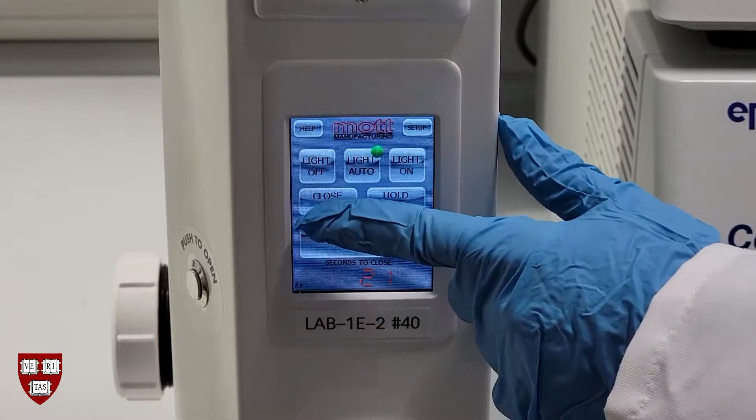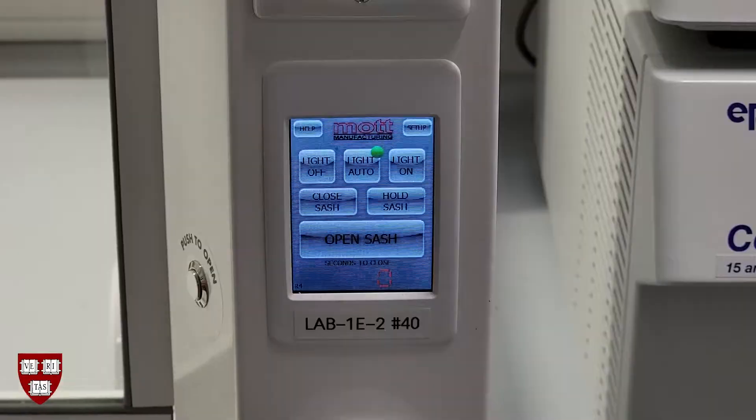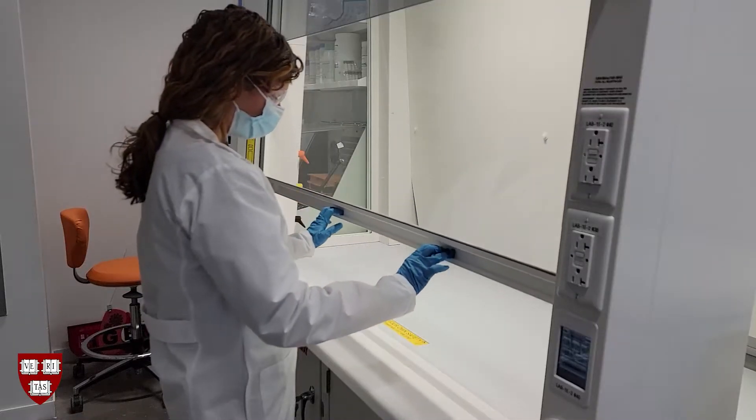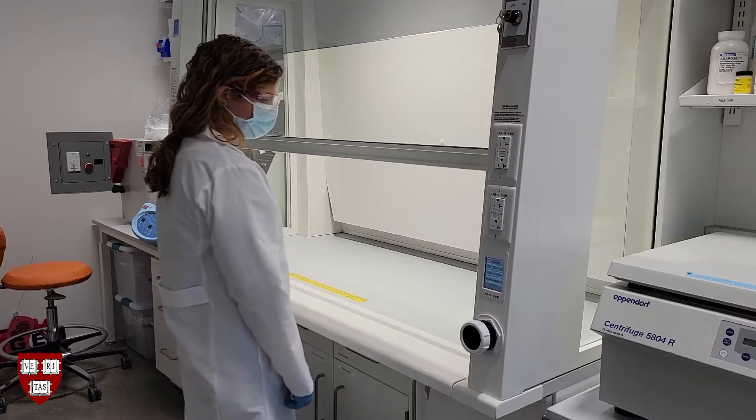It's best practice, however, to close the sash before walking away from the hood. To close the sash yourself, press the close sash button on the digital control panel, or you can close the sash manually by pulling down on it with two hands.